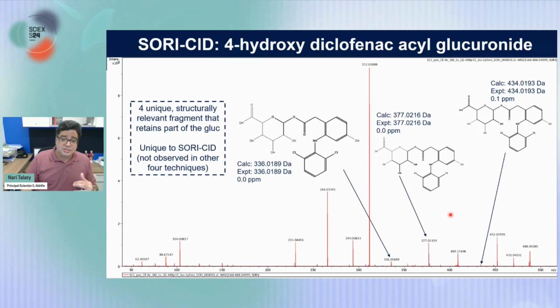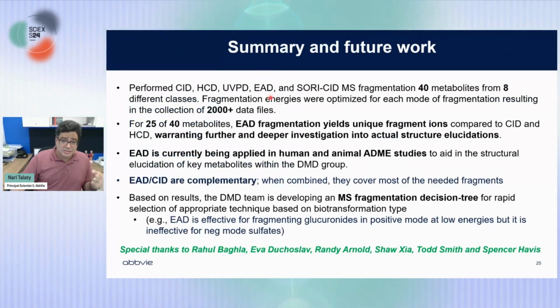Once again, this data compares with EAD. So if you can obtain similar results, the EAD is doing and standing on its own, even when compared with this FTICR SORI platform.